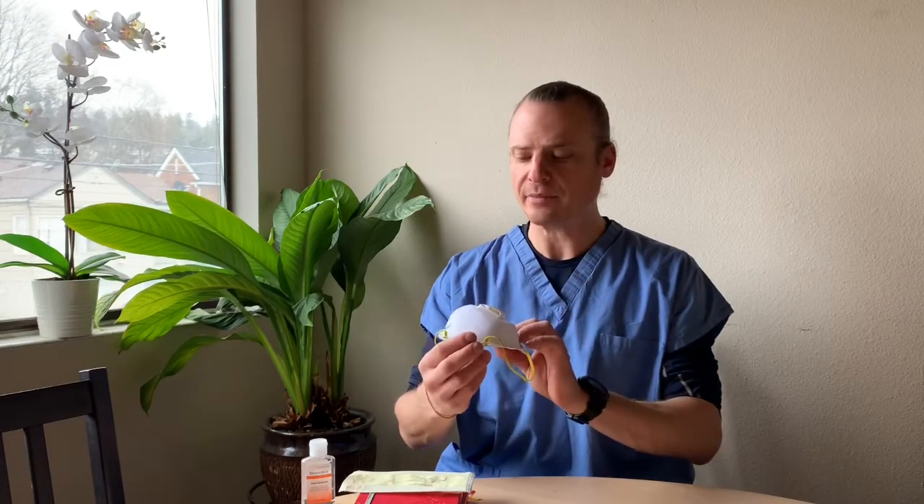Here we have a standard N95 respirator made by 3M — a really good, highly recommended company — with an exhalation valve. This plastic valve allows you to wear this mask for longer periods of time more comfortably, because it circulates air and keeps your face cooler, so you can potentially wear it for a long time.